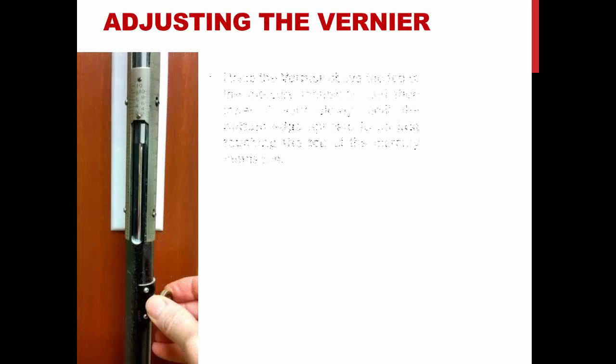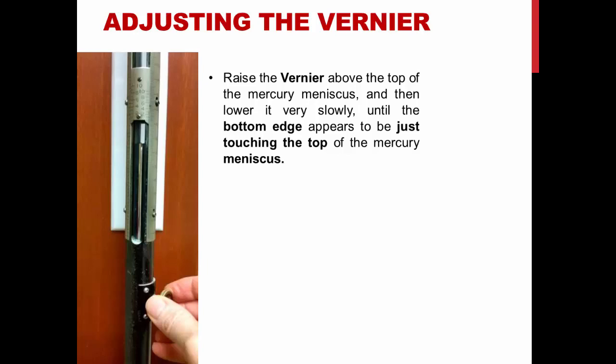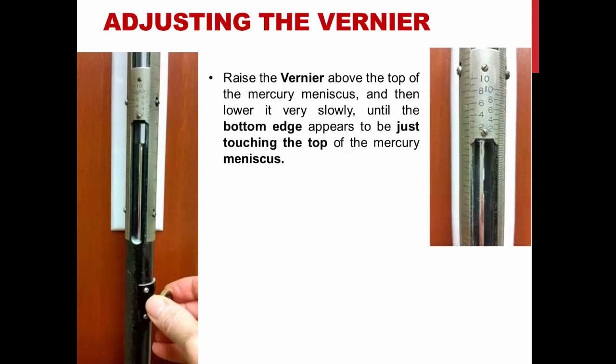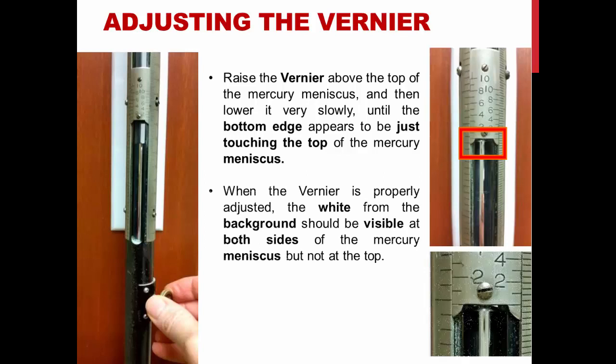Adjusting the vernier. Raise the vernier above the top of the mercury meniscus and then lower it very slowly until the bottom edge appears to be just touching the top of the mercury meniscus. When the vernier is properly adjusted, the white from the background should be visible at both sides of the mercury meniscus, not at the top.